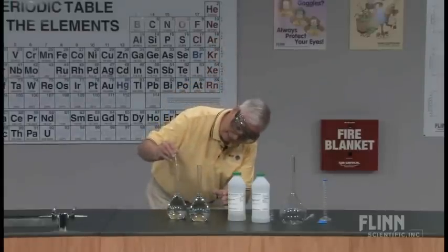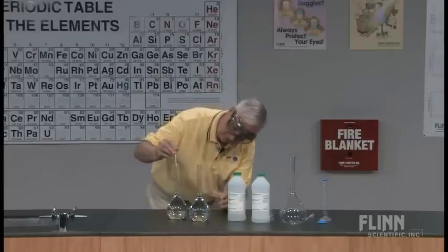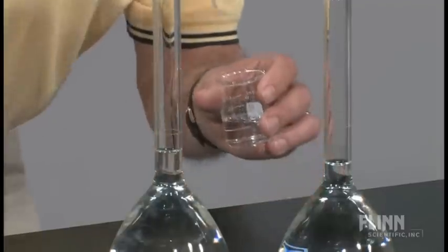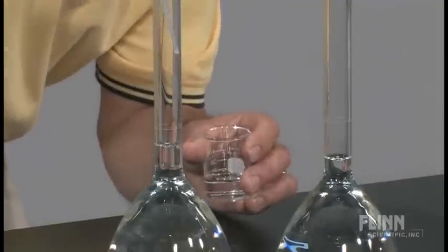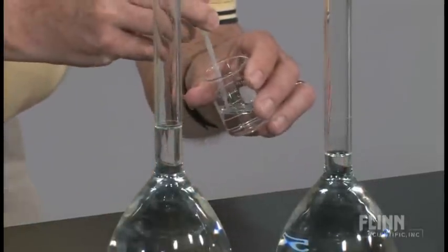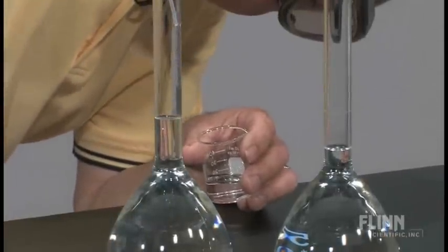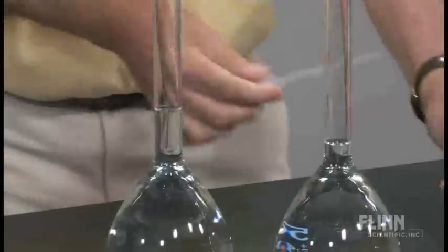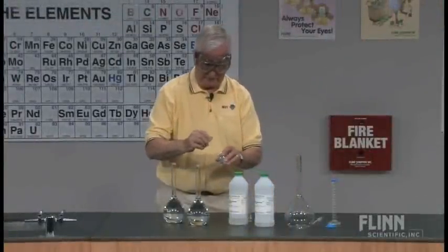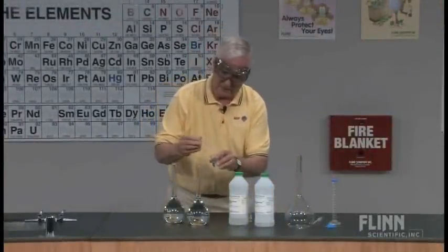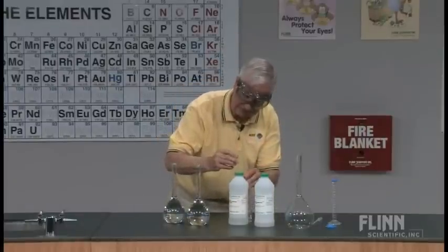I'm going to do that by adding and bringing it up right to the line of the volumetric flask. No doubt you have some volumetric flasks in your laboratory — they are usually used to prepare molar solutions. We want exactly 500 milliliters of the 2 molar sodium hydroxide and exactly 500 milliliters of the 2 molar hydrochloric acid solution.